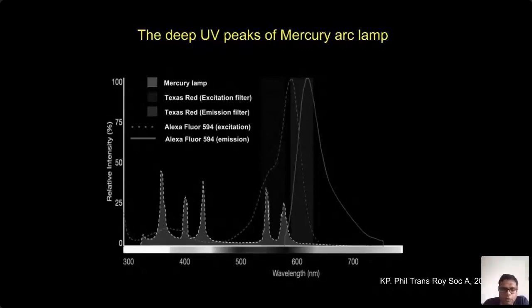And the coolest thing about this was I could just go on imaging, like in DNA-PAINT, right? You can just go on imaging 2 million, 5 million signals. It's just like binding on and off, right? Similarly, in this case, with Alexa 594, the signals I could just continue imaging.